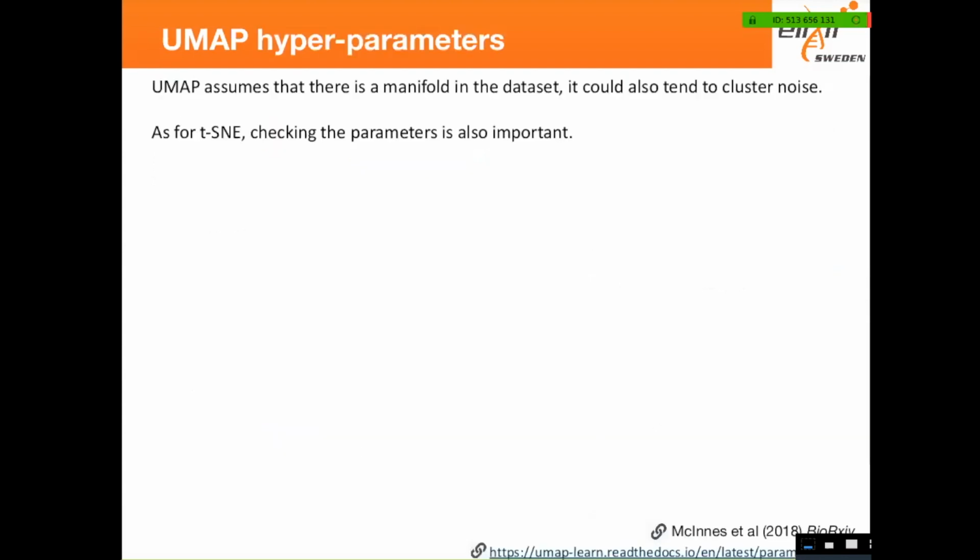Yes? Do we care about tSNE anymore? That's a good question. I'm not sure yet if we are ready to discard tSNE, but UMAP is really good. Many researchers still prefer to have, for example, if you have clusters, them separated, and just for cluster visualization of your data. But I think we are going towards more UMAP.